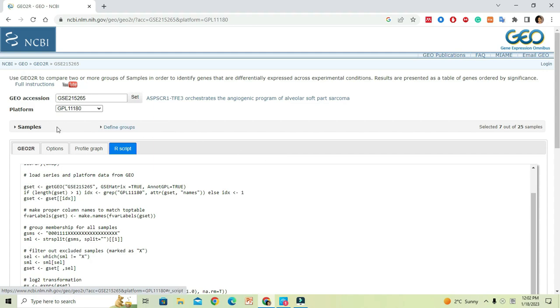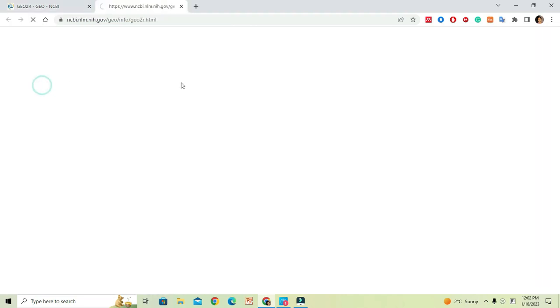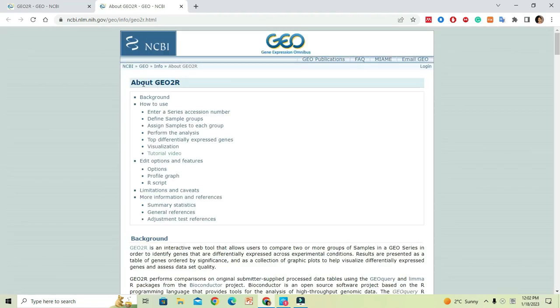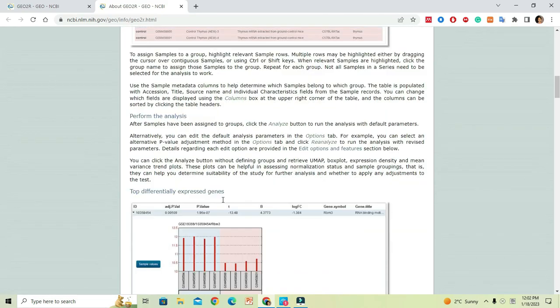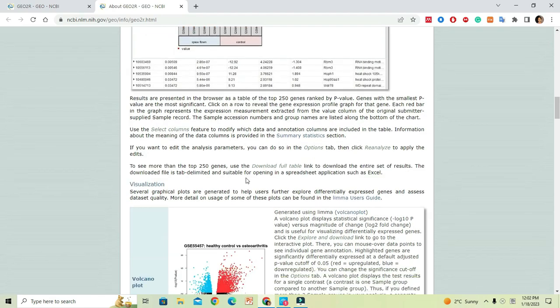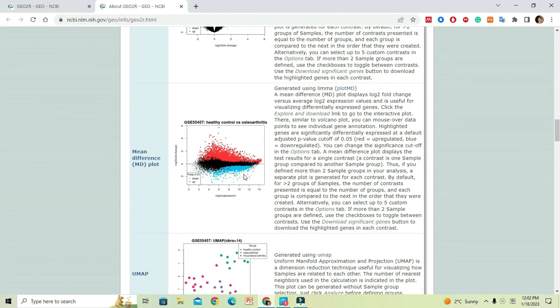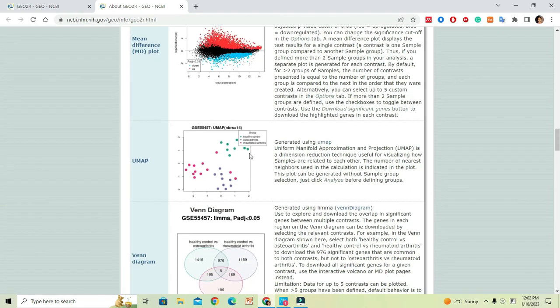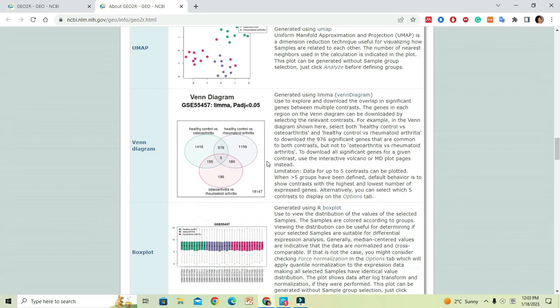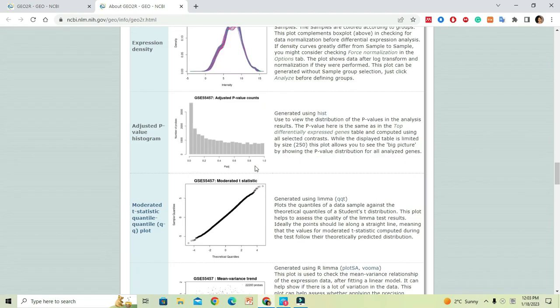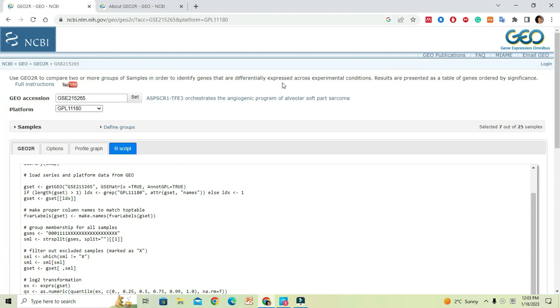If you want to know the full instructions about the analysis, just go up there and click on the 'Full Instructions' link. That will bring you to a new web page containing all the details about the GEO2R analysis. Make sure to go through the documentation — you will find useful information about the graphs and what R applications have been used during the analysis. That is pretty much about the GEO2R statistical platform. I hope you can now do your own analysis using GEO2R.